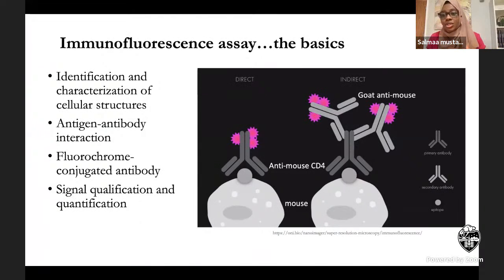There's a way you can tell the program that you're only interested in certain signals, because dead cells usually spill things that get bound with antibodies. So you can program it to show the signals that you're interested in.